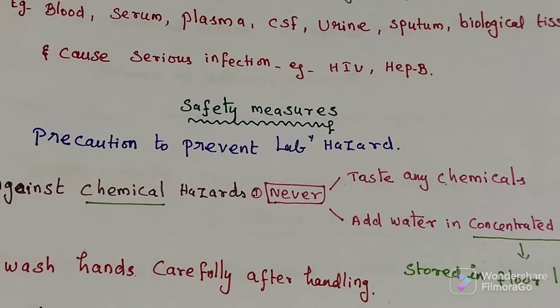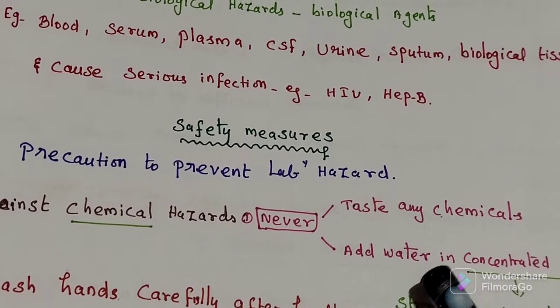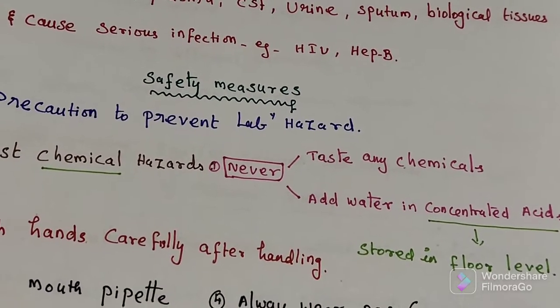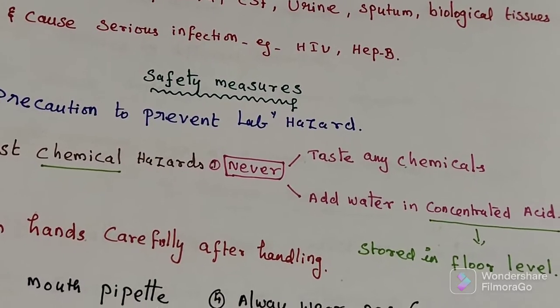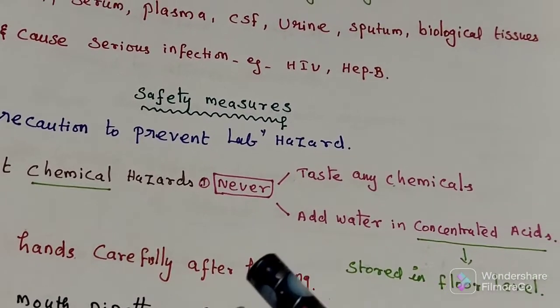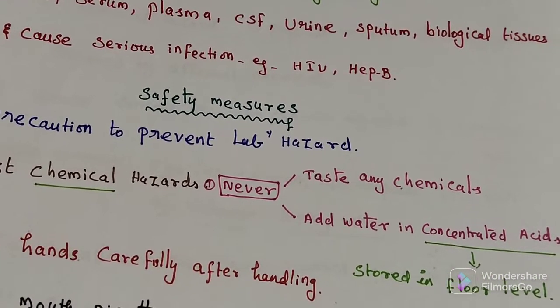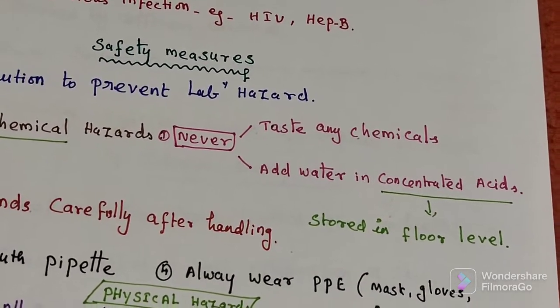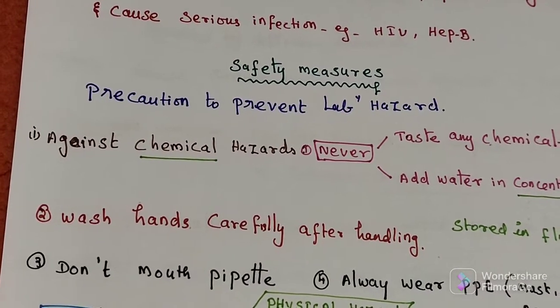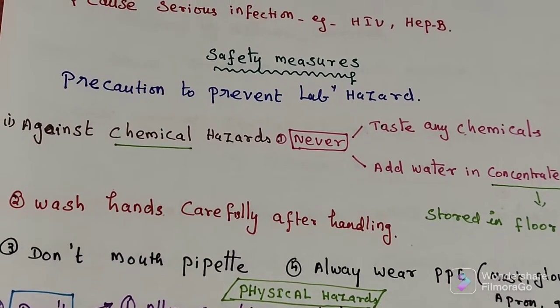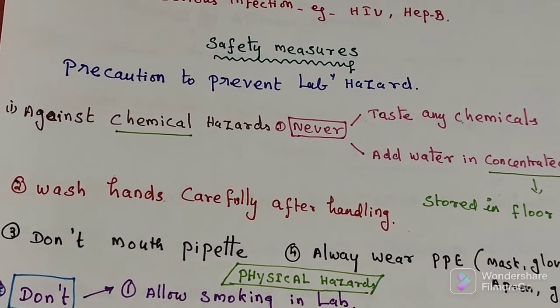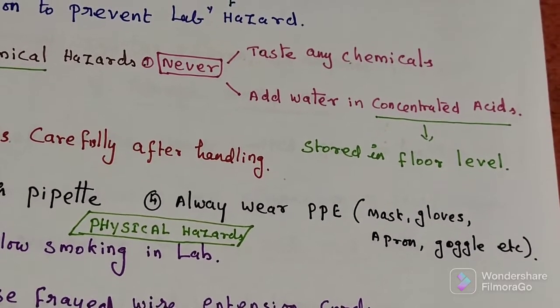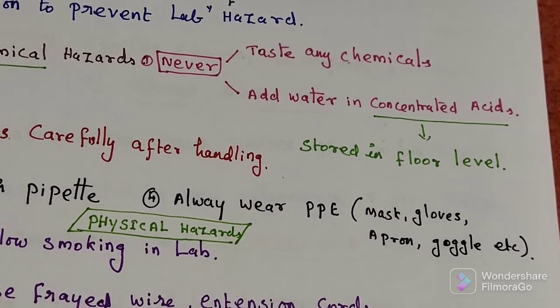Never taste any chemical in the laboratory. Never add water to concentrated acid. All concentrated chemicals must be stored at floor level. Wash hands carefully after handling hazardous chemicals. Don't pipette any chemicals by mouth. Always wear personal protective equipment while working in the laboratory, including face mask, gloves, lab apron, covered shoes, and goggles.